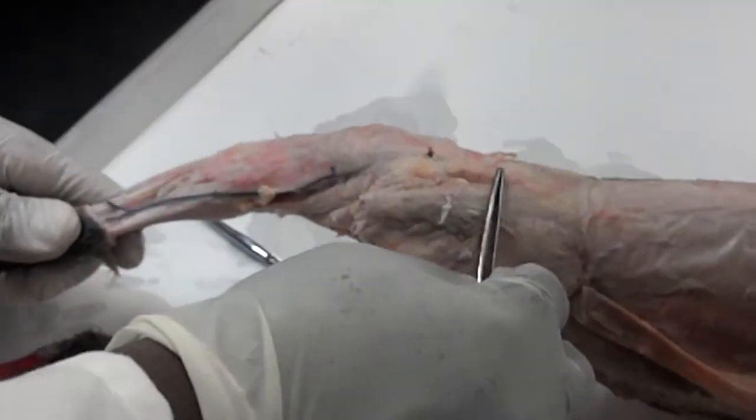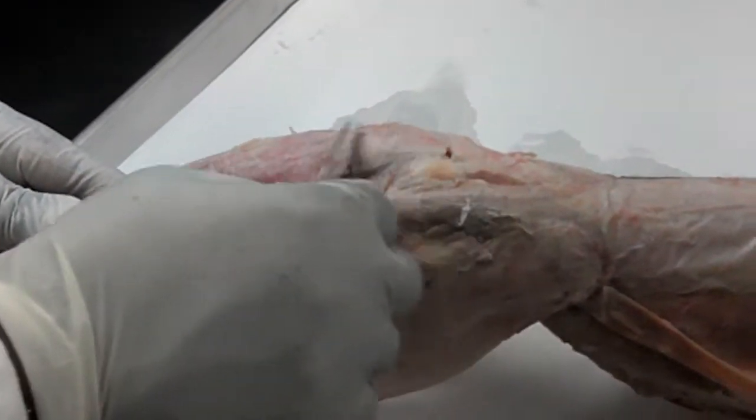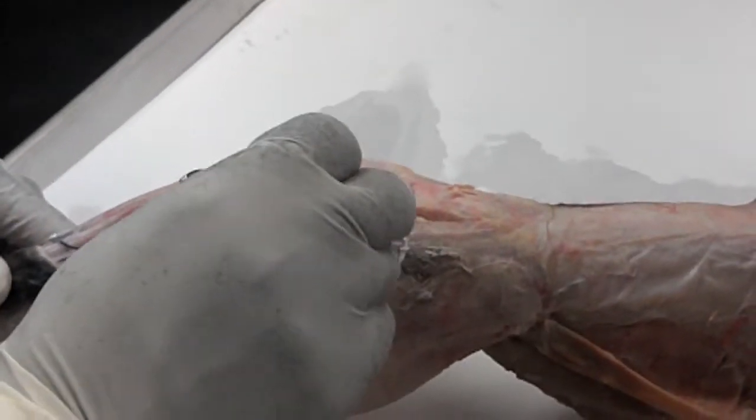On the lumbar area and the back legs, superficial, we're gonna have, well, I don't know where to say. Let me start here. That's the caudofemoralis. Okay. When you get confused here, just start from this one. Caudofemoralis. The next one is gluteus maximus. Then the next gonna be the gluteus medius. Gluteus maximus, gluteus medius.